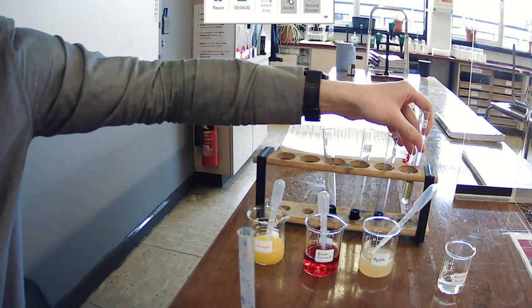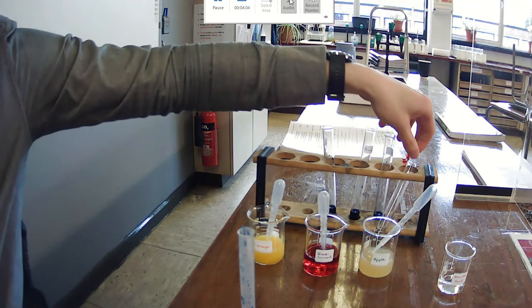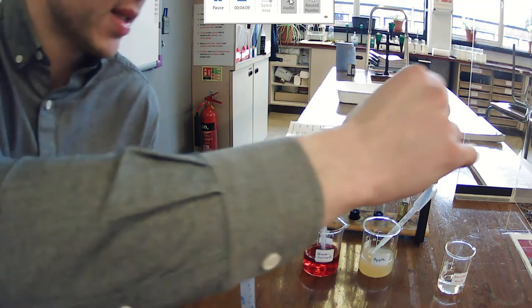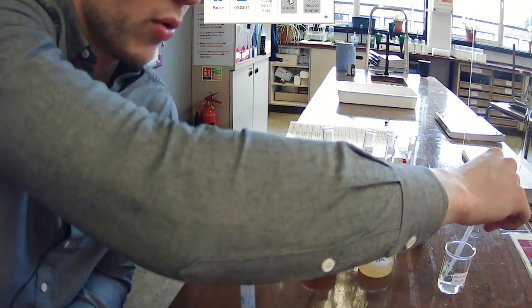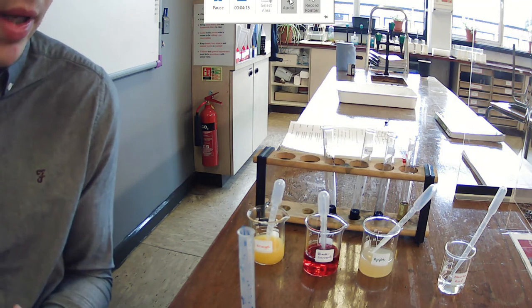And we're going to move on now to our next sample. So in our table in our book, we will need to record that. Now I'll show you what the table should look like after we complete all of the tests. And it's very important also that we change pipette each time because we do not want to contaminate our sample.